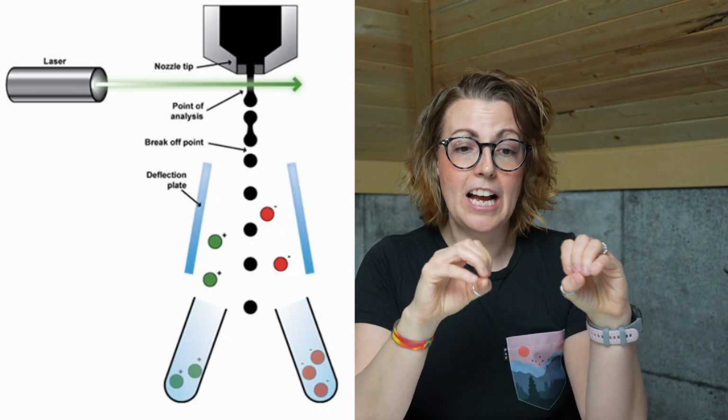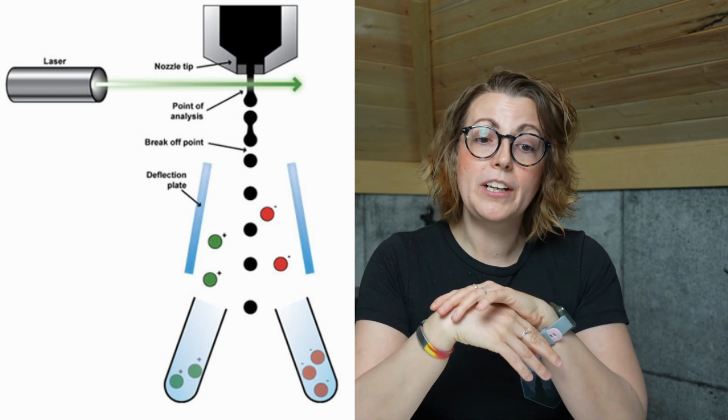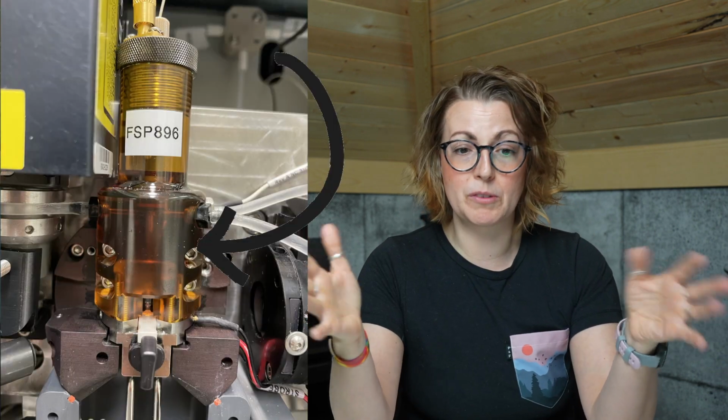When we look at a cell sorter, you'll find that it has many of the same components as a standard flow cytometer: fluidics, optics, and detectors. However, cell sorters have additional hardware and electronics that allow for sorting. Working our way through the instrument, the cells are taken up and focused in the flow cell using hydrodynamic focusing, all words you've heard before.